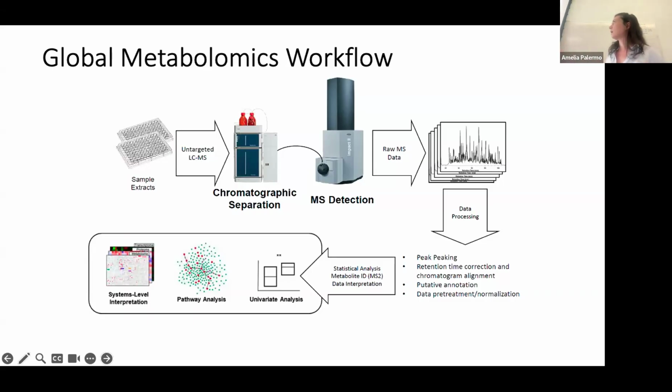In this case, this is a time-of-flight analyzer. It accelerates the molecules based on their charge and mass across two different potentials, and then measures their time of flight. That time of flight is proportional to their mass, but also to their charge. So if we keep the charge constant, we will be able to separate these molecules based on mass. That is the basic principle of how these molecules are measured.